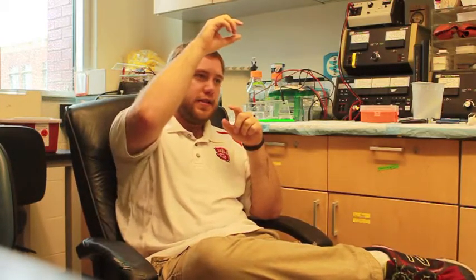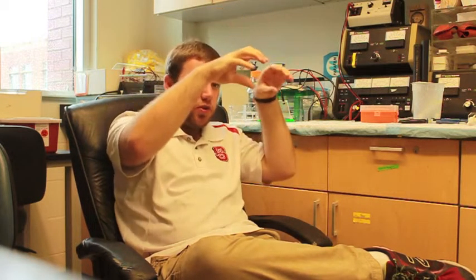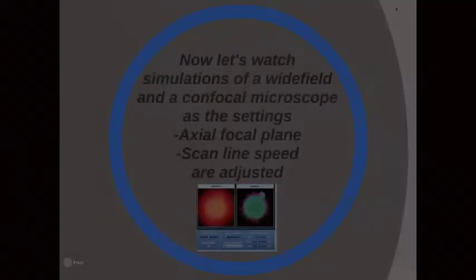So what happens is, this little photon comes up here, gets inside of the multiplier tube, and hits this, and that portion up here is going to bounce into 2, it's going to bounce into 4. So it's basically an amplification of the signal. The downside with that is, the more you amplify a signal, the more background noise you get. So if you amplify too much, you're not going to be able to read anything. Your signal to noise ratio is going to be real bad.